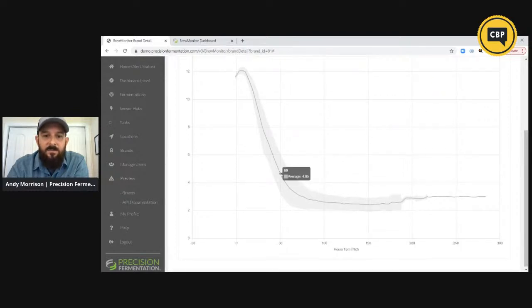So I'm looking at, let's say 50 hours into fermentation, what was my average Plato reading, how far along on average were each one of my batches. And so I can look at that and see, okay, I was at 4.5 degrees Plato, just above, right, on average. Then I've got my standard deviation measure that kind of gives me, here's from max to min, here's my standard measures kind of surrounding. So how variable were all of those data sets? So you can see it's a pretty small variation here at the top, which we'd expect to see, right? We're knocking out kind of around that same point.